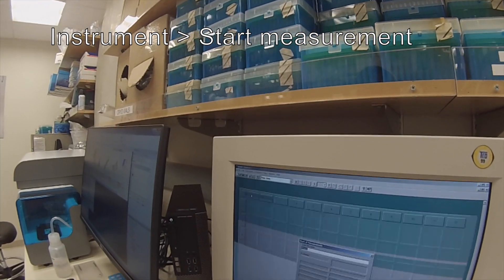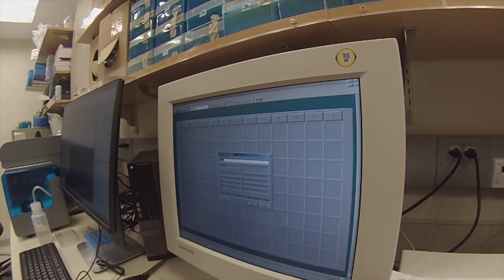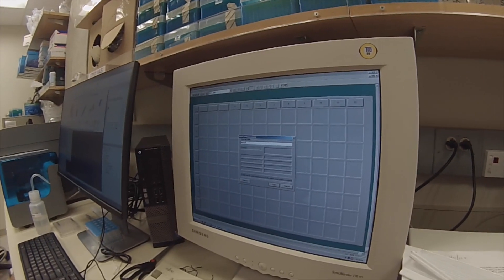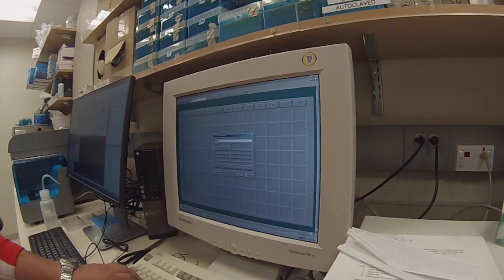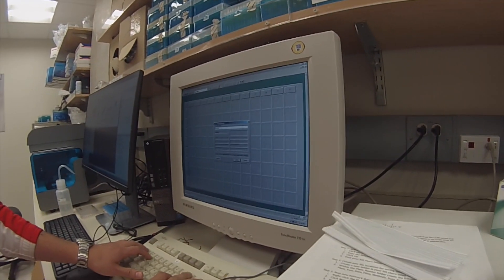We're going to name it as we wish. In this case I'm just going to put microglia because it's our microglia cell lysate samples and today's date.